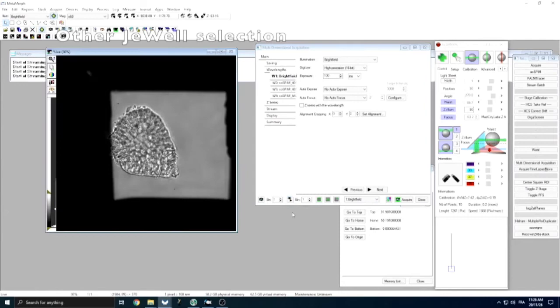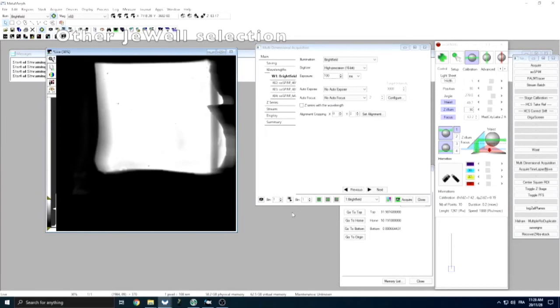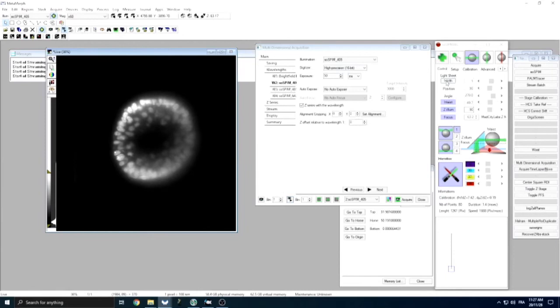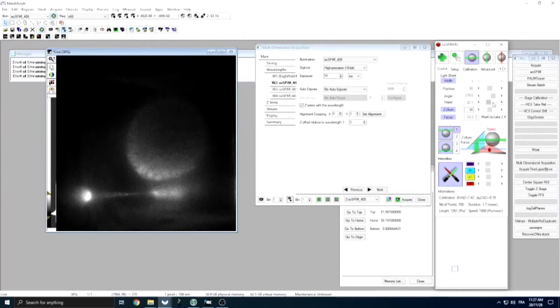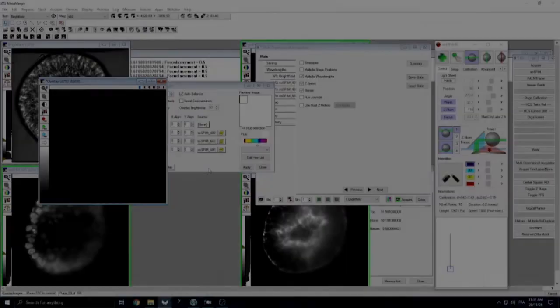An important property of the SOSPIN device is that they display tens to hundreds or thousands of wells per device, arranged along a precise array. We can therefore easily go from one well to another in order to image multiple cysts or samples in a single experiment, greatly increasing the acquisition throughput. We just select another good-looking sample, adjust the light sheet depth to superpose the excited and image planes, and also adjust the light sheet waist according to the sample position in the well to optimize the optical sectioning and the final Z resolution. Then we launch the acquisition process on a specific region of interest.